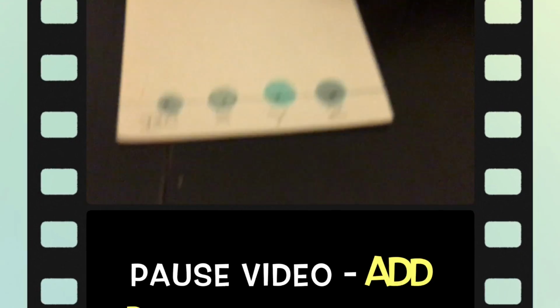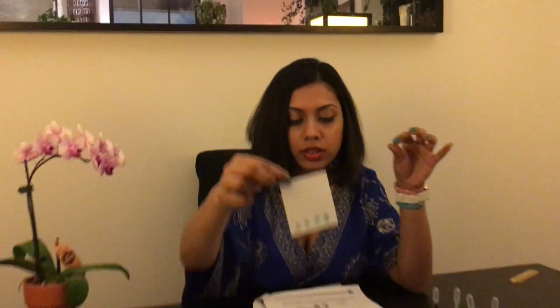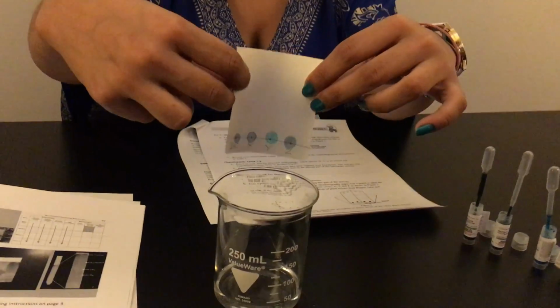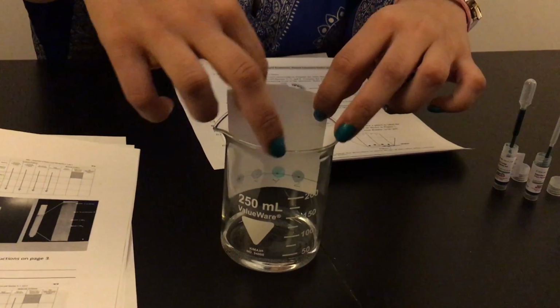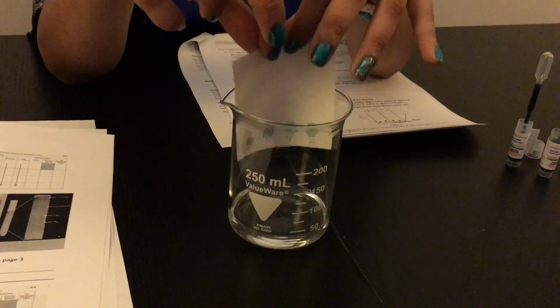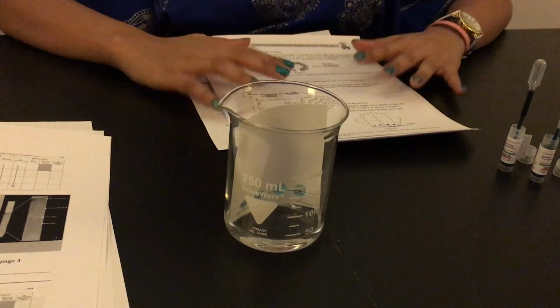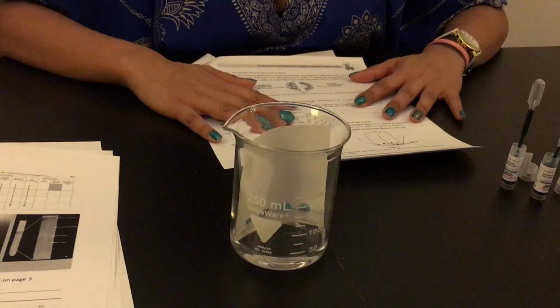The next step is to put this filter paper on water. Once you have your paper labeled and all the pigments put in the appropriate place, you're going to bend your paper slightly like this, curve it so that it can fit into the beaker. You're going to fill the beaker with water up to the first marking, and then you're going to place the filter paper right in the beaker and wait for the pigments to rise.